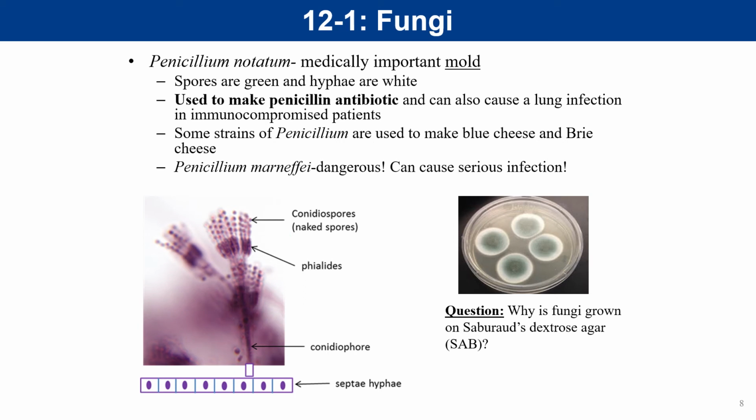And conidiospores can also be referred to as conidia. And these are all genetically identical structures. Penicillium does not have the ability to make sexual spores, so we only observe their conidiospores, and we can say that these also might be memorable as looking like little brushes or brooms that you would sweep a floor with. And so this is how Penicillium looks under the microscope.